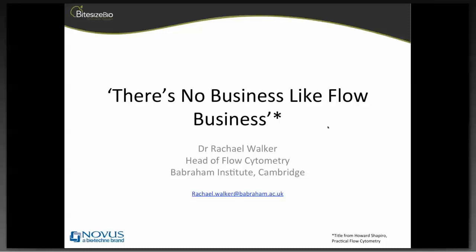Today in the webinar, I would like to go through how flow cytometers work in order for you to get the most out of your experiment, so that you realize it's not just a box that's in your lab. I hope to show you the increase in popularity of the technique and how it's evolved. So let's start at the beginning.